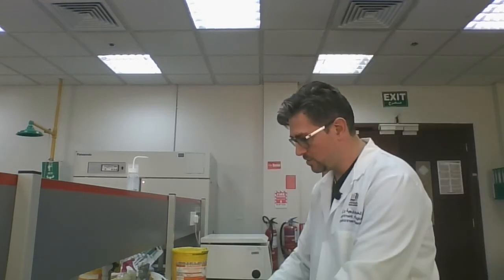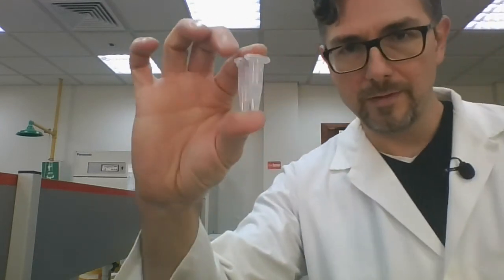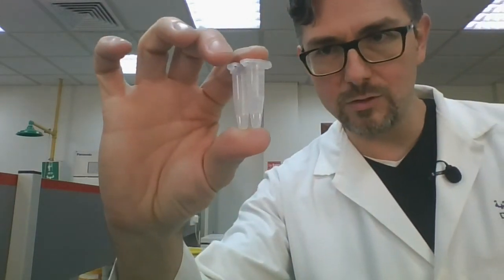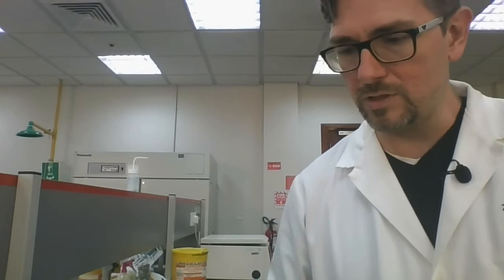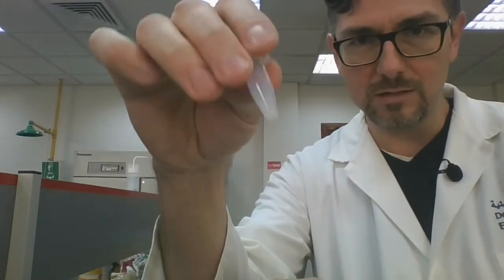Okay, and so I now have two tubes that contain my solution and the pellets. And what I need to do is just break up the pellets. So I'm going to use the vortex, and I'm going to just use a high speed to break up these solutions. Now, one way to do this is to make sure that when you are putting your epi tube into the vortex, it's at an angle. So don't put it in like this. Put it at an angle about 45 degrees, and that tends to give you the best mixing action.